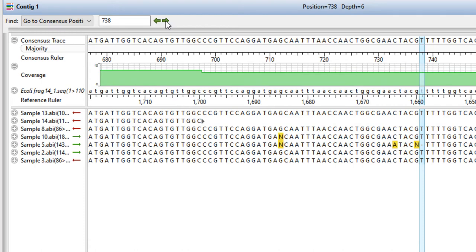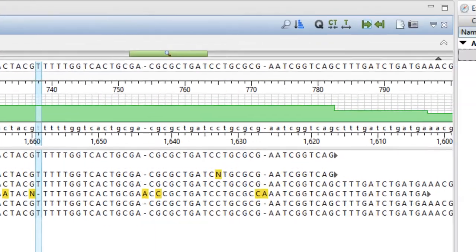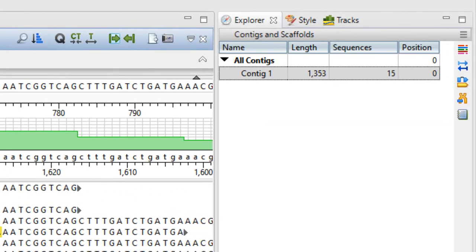To view assembly coverage, click the second tool on the upper right to open the strategy view.